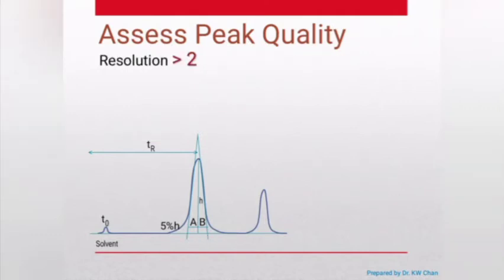Then how about the resolution? Resolution means how well the peak is separated from the neighboring peak. A good resolution value should be more than 2. The value can be produced using this formula.